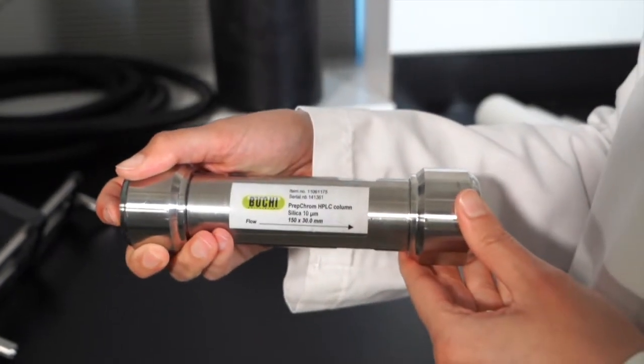Our prep HPLC columns are filled with high-quality silica and enable the performance of high-resolution separation. Easily accessible from 4.6 to 70 millimeter inner diameter and phases such as silica, C18, C18-AQ, and C4. Our consumables line enables you to choose the best flash or prep HPLC column that best suit your purification needs, and is compatible on all competitive systems.